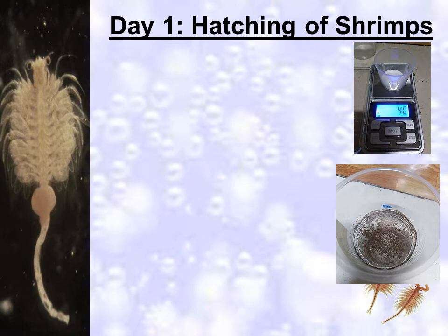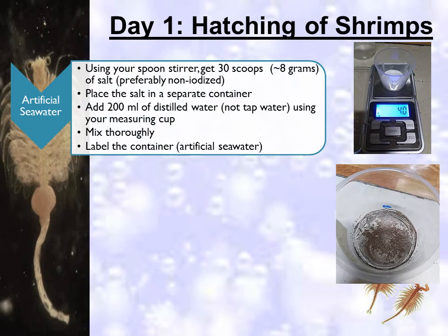In hatching the shrimps, first prepare your salt solution or artificial seawater. Using your spoon stirrer, get 30 scoops or approximately 8 grams of salt, preferably non-iodized. Place the salt in a separate container and add 200 ml of distilled water using your measuring cup. Tap water should not be used since it contains chlorine; if there is no other option, the tap water must be left unused overnight to remove chlorine. Mix thoroughly and label the container properly.